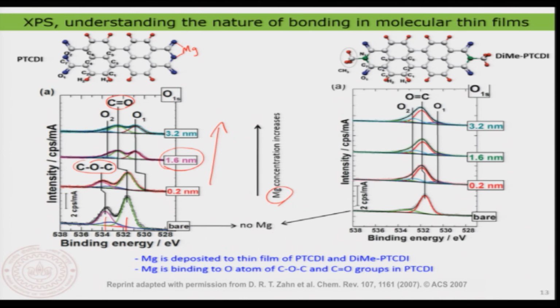So, how do I see that? Because I see that the resonance corresponding to the COC is almost vanished or maybe shifted downwards, and that is what is written here with the O2, and also you can see the carbonyl peak is just getting shifted also to the lower energy. So, that means this oxygen is also getting a bit more oxidized than its nascent state. Yeah. This is quite interesting.